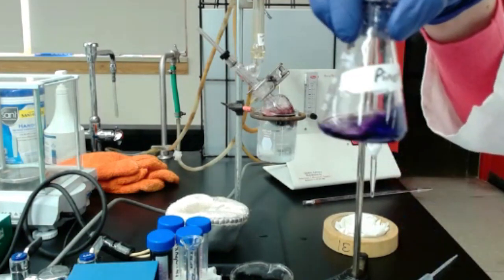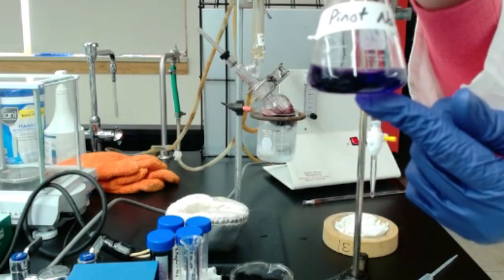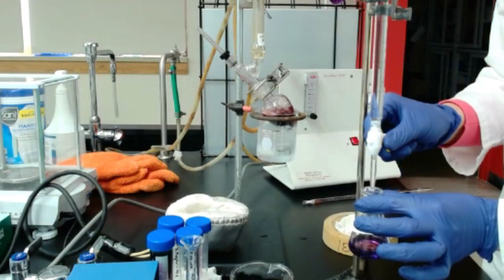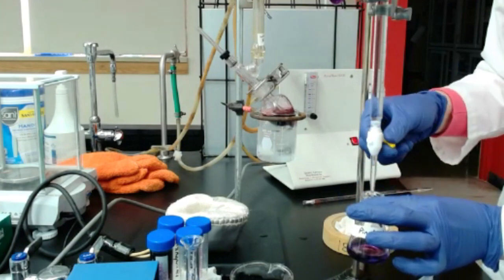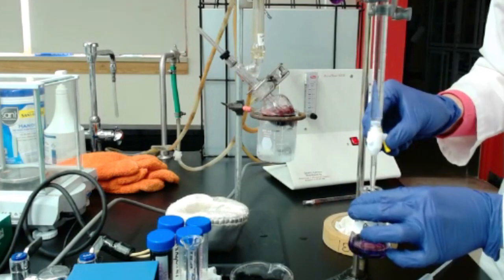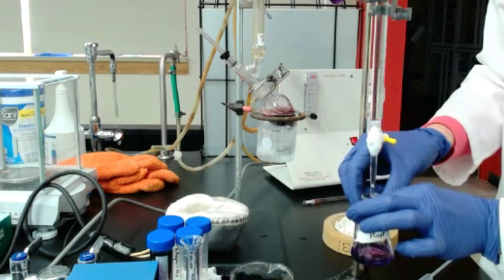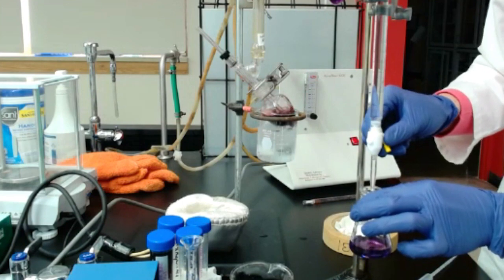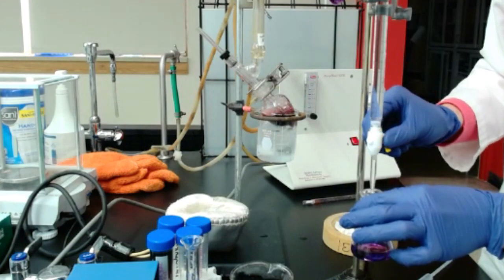I have the results of total SO2 in this flask, so I'm going to do the titration. I will just go at the bottom and add some sodium hydroxide, drop by drop, and stir. Make sure you stir all the time, because if you don't, that's going to lead to an error, because it won't be homogeneous and the change of color won't happen very much. So here I add a little bit more than the other wines, and that's probably because that's a fresh new bottle of the Pinot Noir.